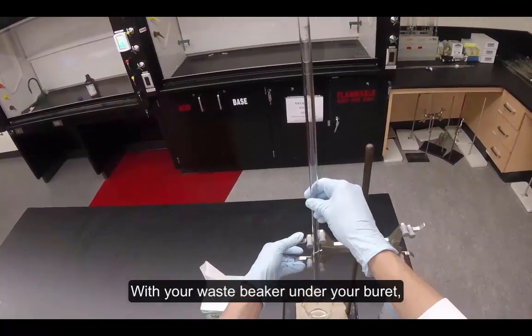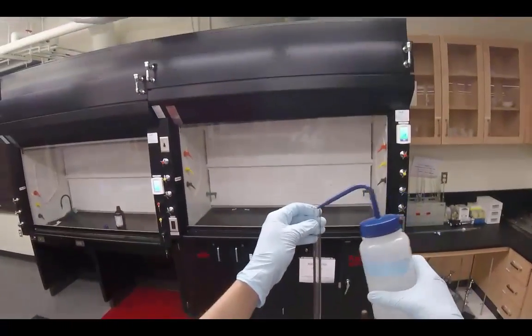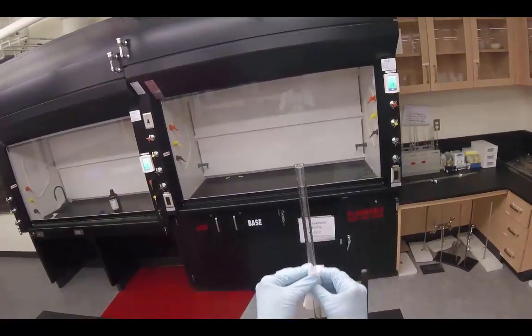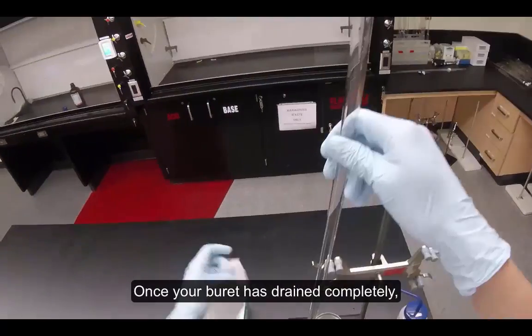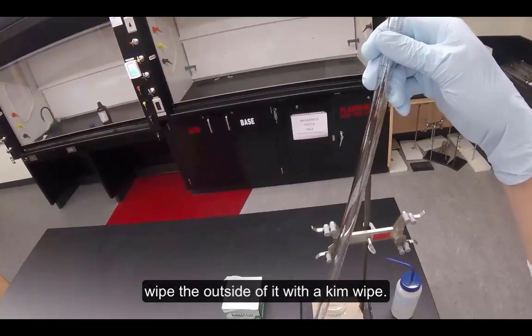With your waste beaker under your burette, rinse your burette with deionized water. Wipe the outside of your burette with a kim wipe. Drain your burette into your waste beaker. Once your burette has drained completely, wipe the outside of it with a kim wipe.